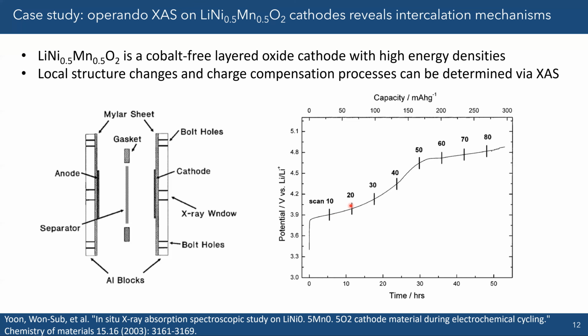So I imagine for the experiments that you're showing here, they probably charged it somewhere, took it off the charging, and then put it on the beamline and then went back. No, so this is purely operando. While it's charging, they just run the experiment.